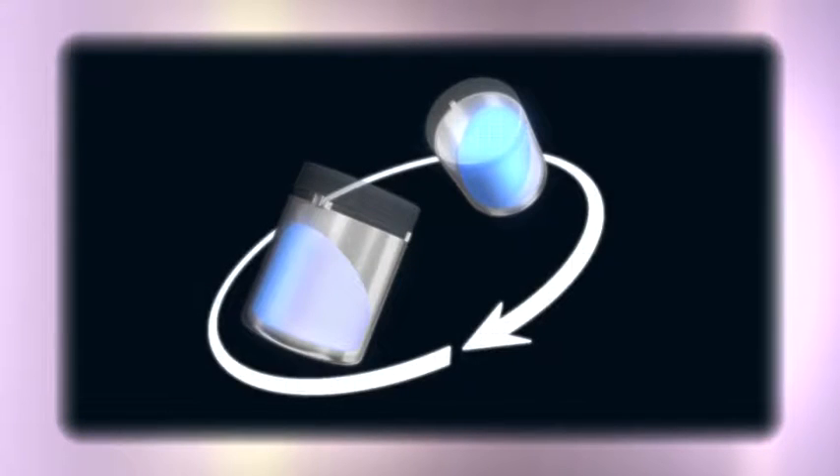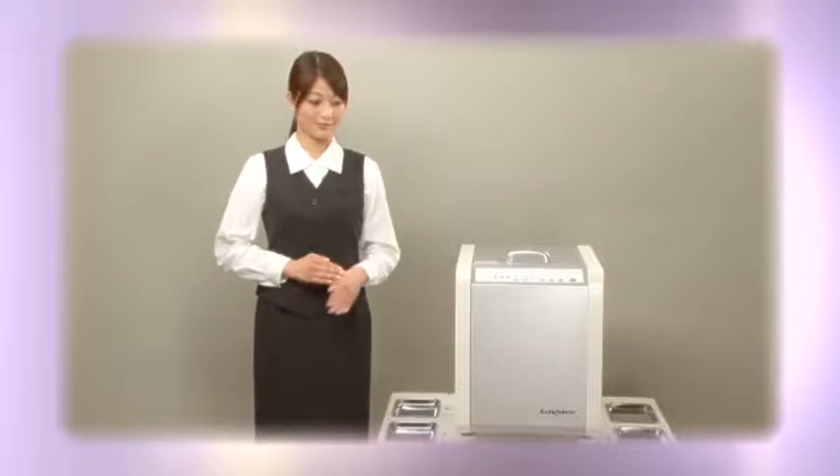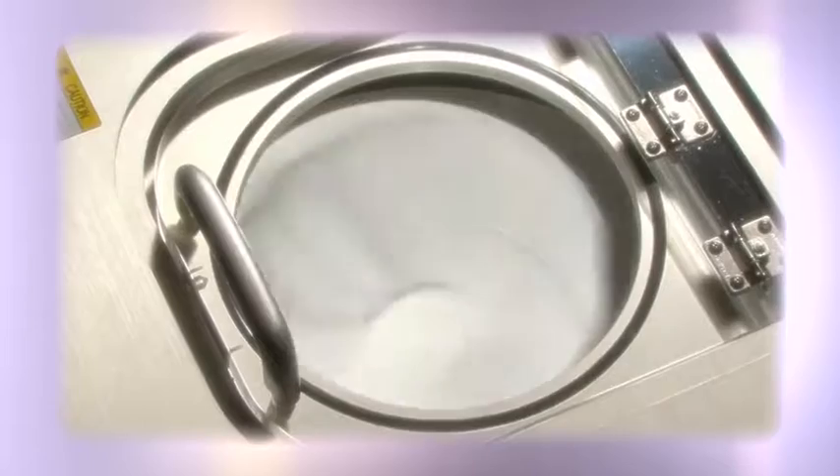Shashin Kagaku's mixer degassers are equipped with sophisticated features and independent control over revolution and rotation speeds. If you have any needs or questions, please let us know by email at kakohunter.com.